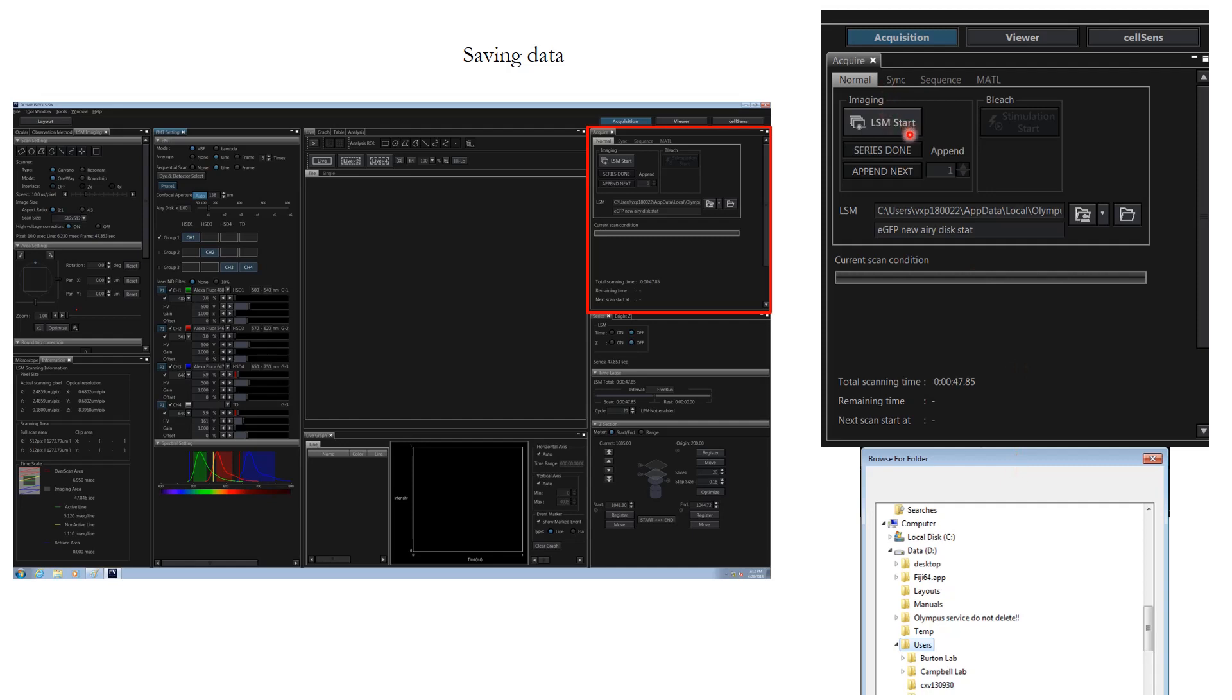Once you are done with setting up these parameters, you can click LSM start and image acquisition is done. Then you can say series done and it will be automatically saved. The software has a very good feature that if the name is not renamed to a new file name for the next imaging, it will simply add 001, 002 without overwriting the old data, so you do not end up overwriting your old data and losing all the images.